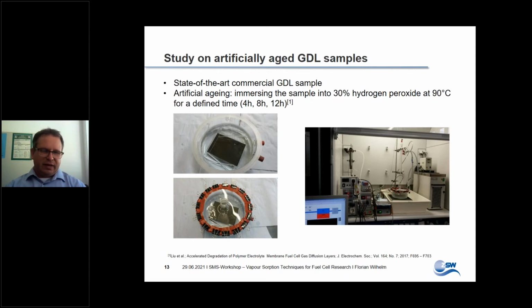And you can see here just some photos of the apparatus. So in principle, on the top left side, you see how the sample is immersed into the solution, and then the vessel is closed and it is integrated into, of course, some monitoring and analysis devices that we need to understand what is exactly going on during the artificial aging.